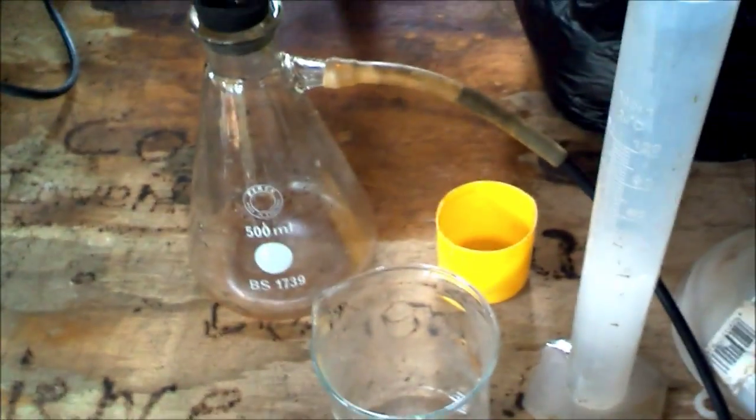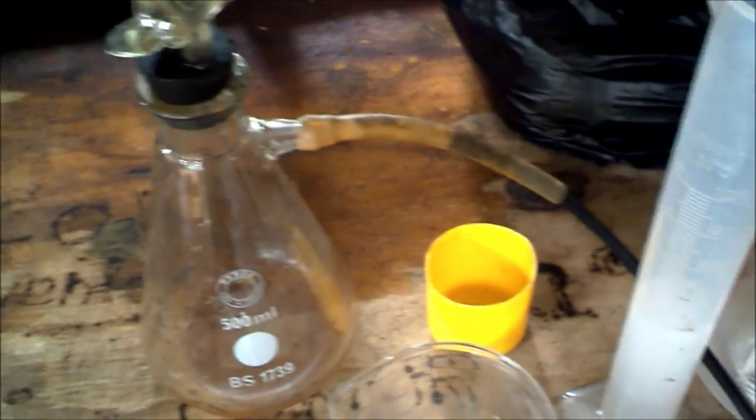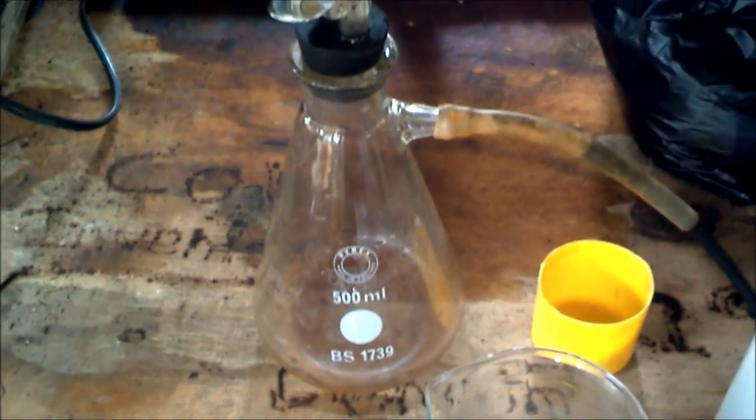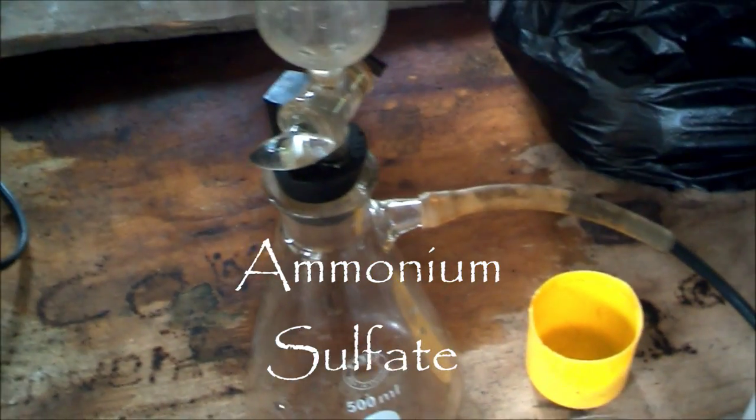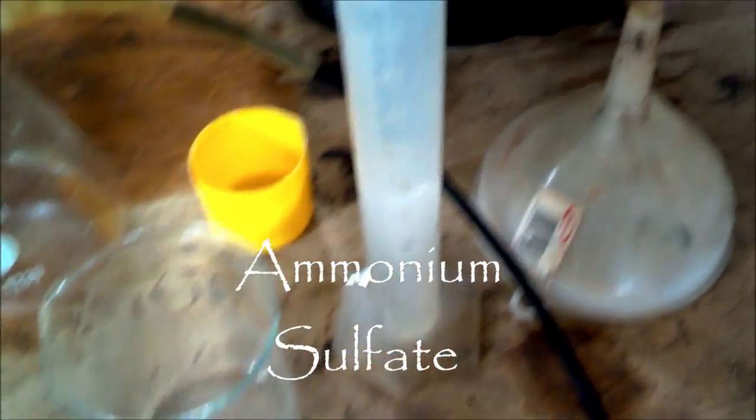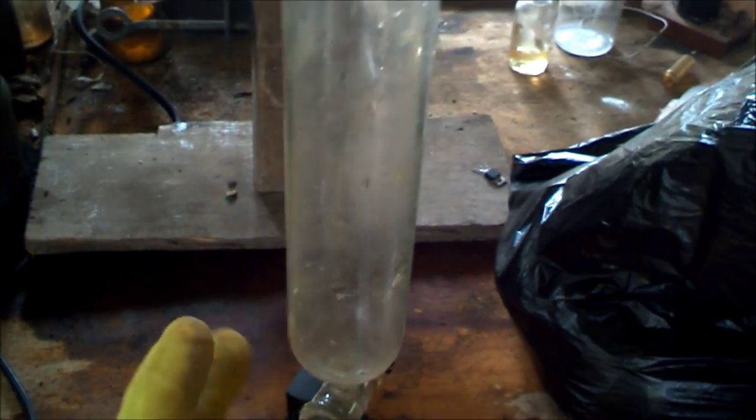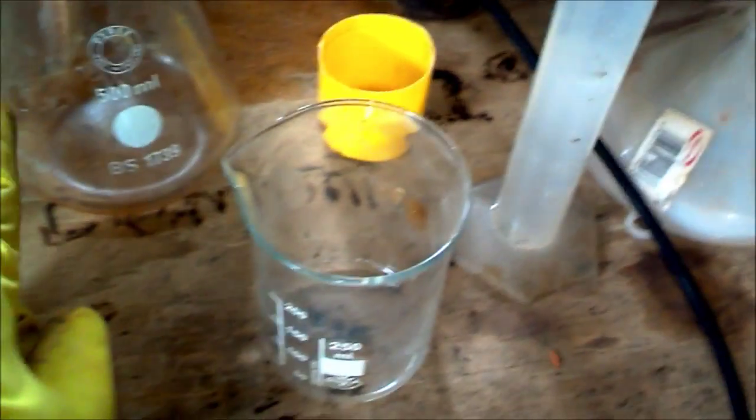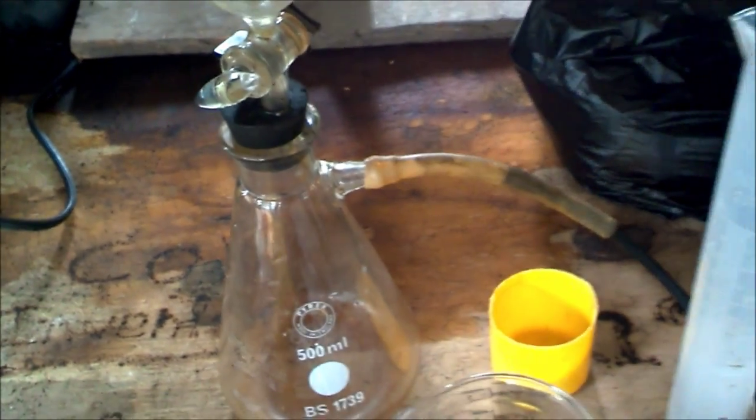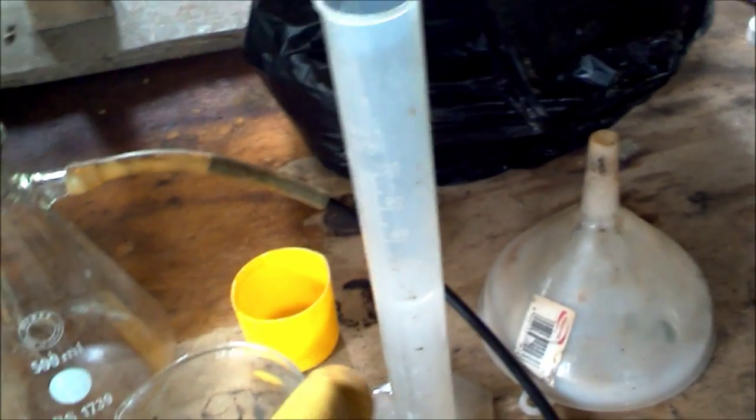Hello guys, today I'll be making ammonia. For this process you need an ammonium salt, but today I'll be using ammonium sulfate since it's readily available in fertilizers. You need a funnel that you can adjust the flow rate of, a flask, a vacuum flask, a measuring cylinder, and a beaker to weigh out the sodium hydroxide.